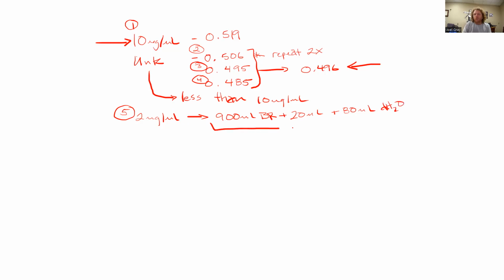Now, one very important thing to remember is this needs to be very thoroughly mixed. Thoroughly mix it by taking that cuvette and tap, tap, tap, tap, tap to mix it up, or use your pipetteman to mix it very thoroughly. If you use your pipetteman to mix it thoroughly, you want to discard that pipette tip.